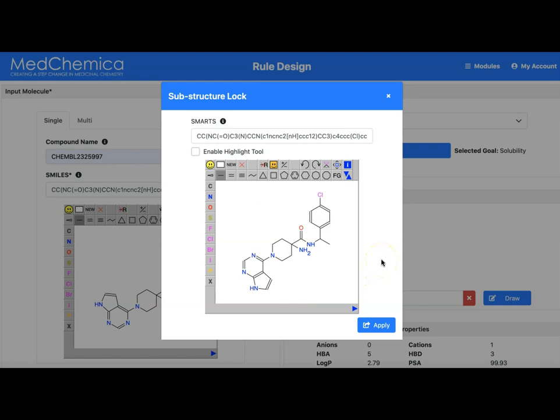Let's consider our medicinal chemistry context here. This is an ATK inhibitor. Here is the hinge binder, a quite specific linker group, and a quite lipophilic head group. As projects often go, we know that part of the molecule is believed to be fairly optimized, or we want good ideas about where to replace this part of the molecule. How do we tell the computer to do this?